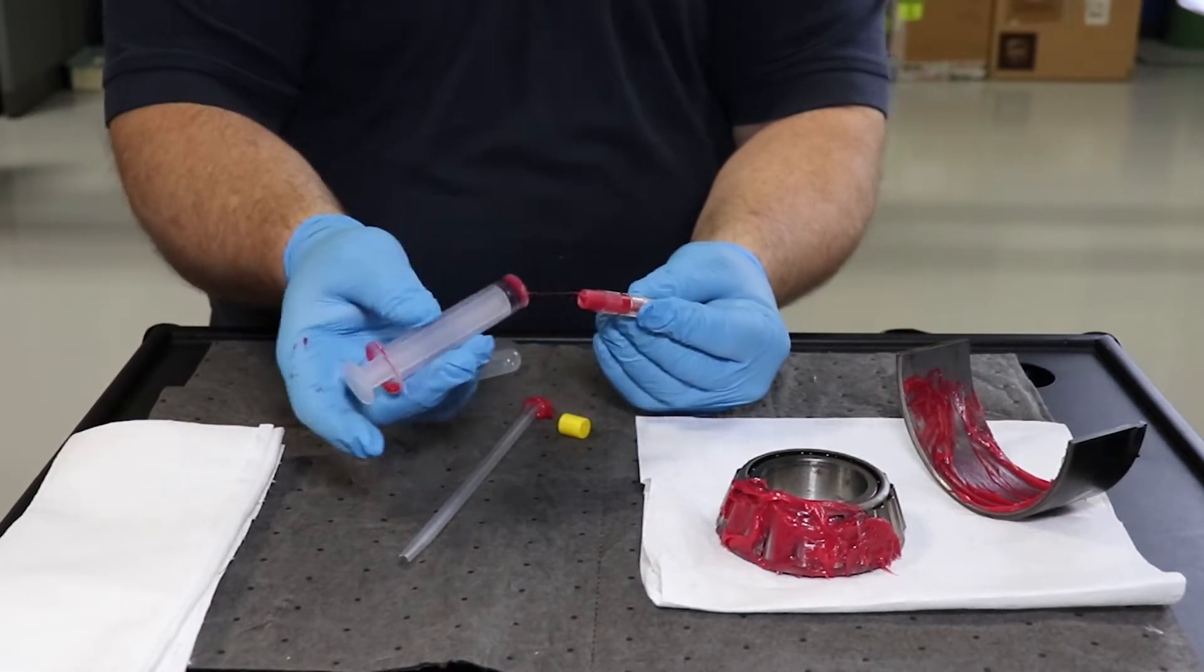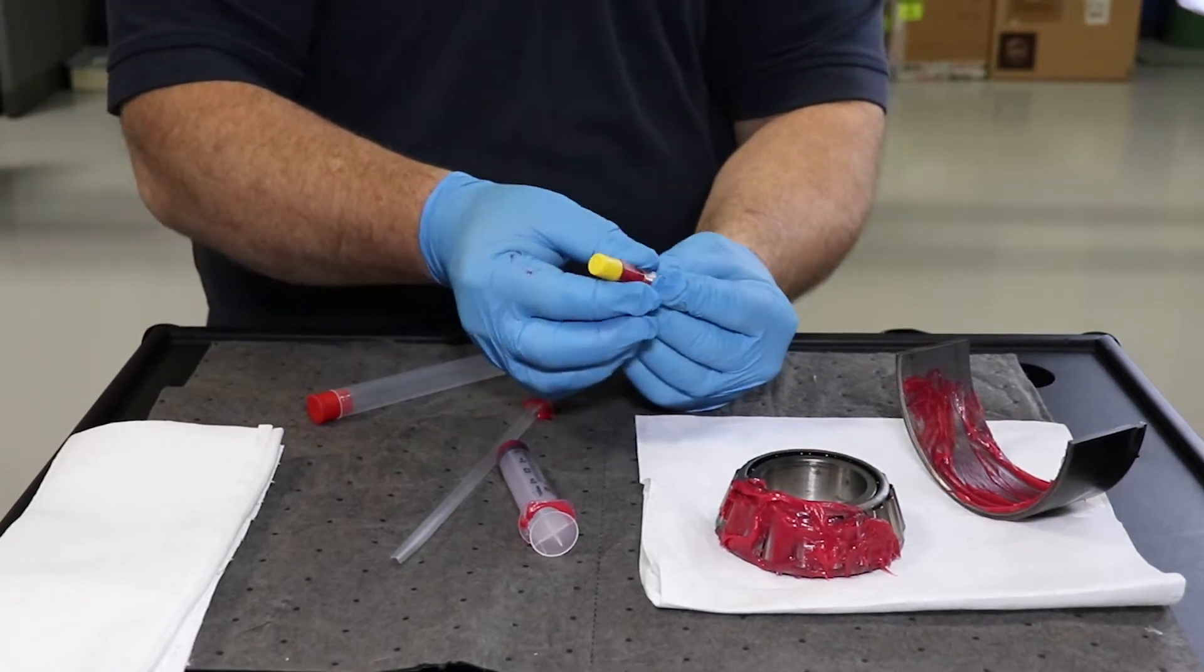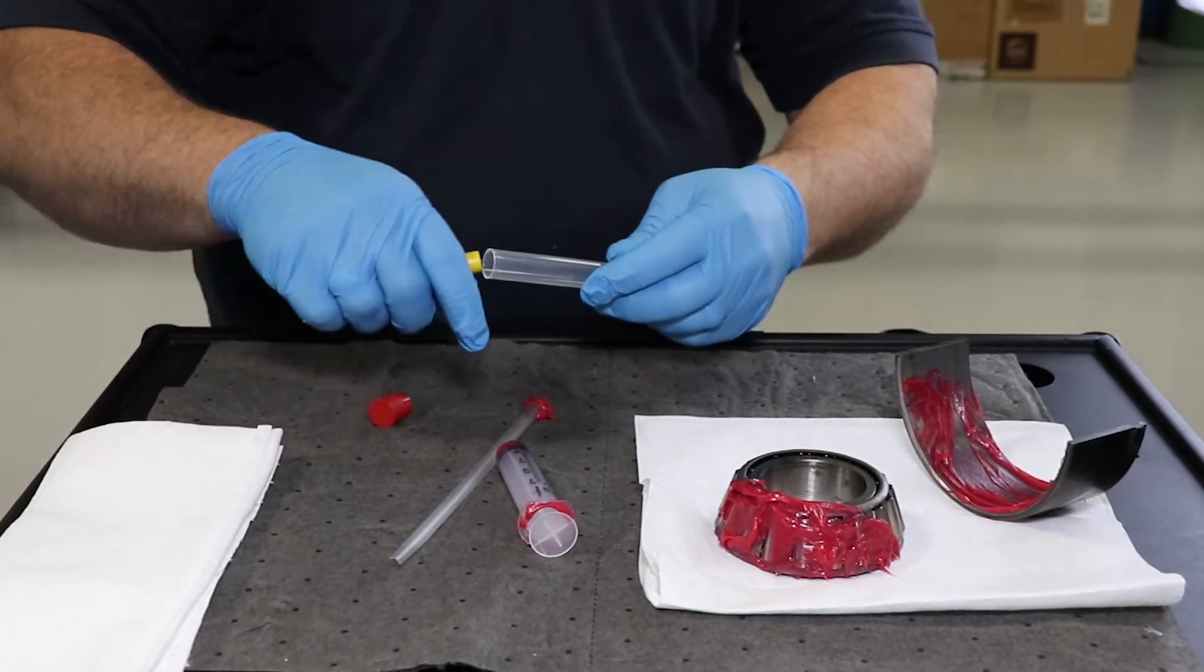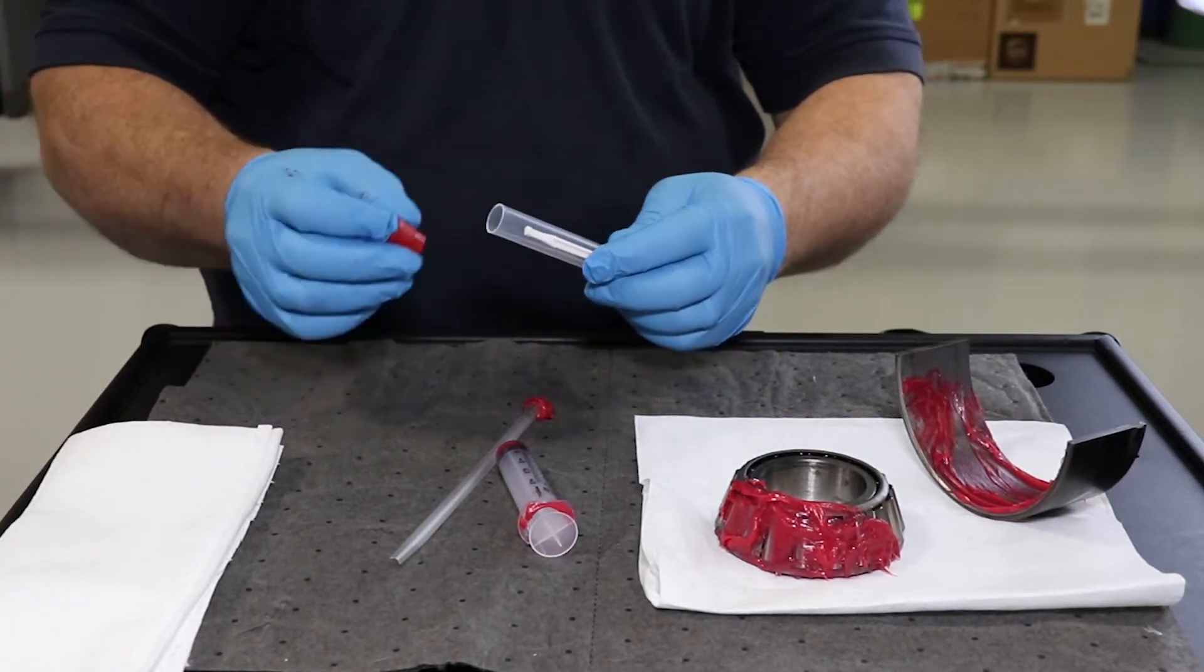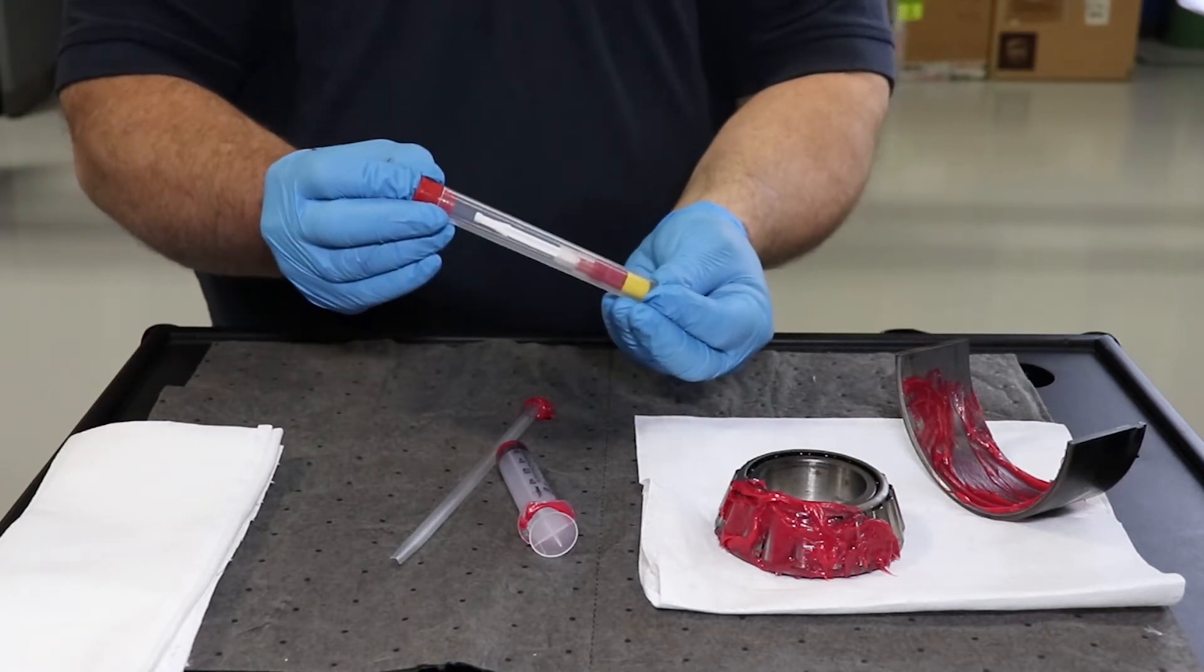Place the cap on the grease sampler. Place the grease sampler into the shipping tube. Your sample is now ready to send to the laboratory.